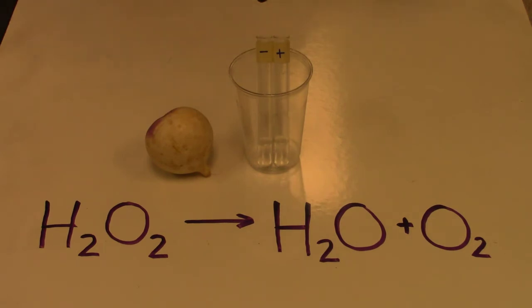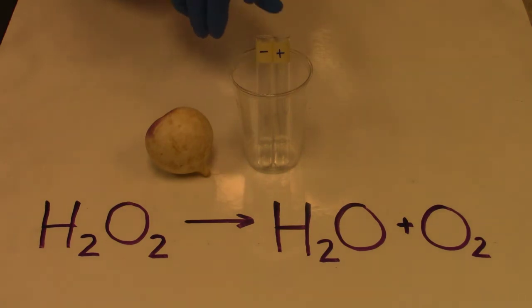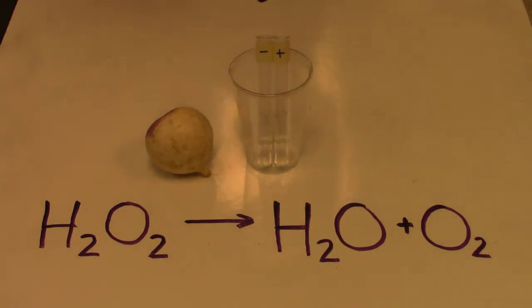Now, before we get mixing, I want you to pause the video and I want you to generate a hypothesis. What do you believe that you'll observe after 5 minutes in our control group as compared to our experimental group?